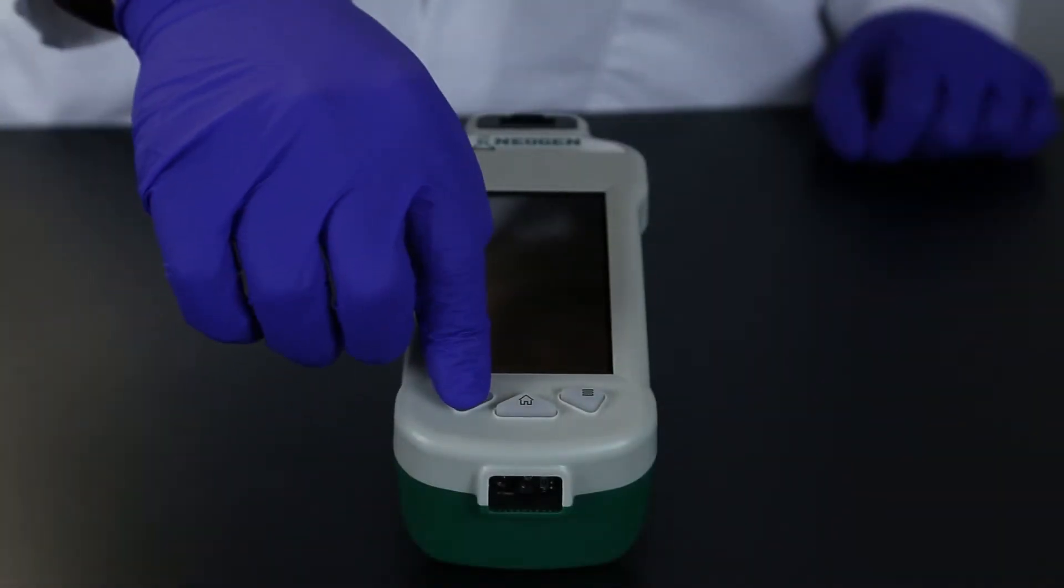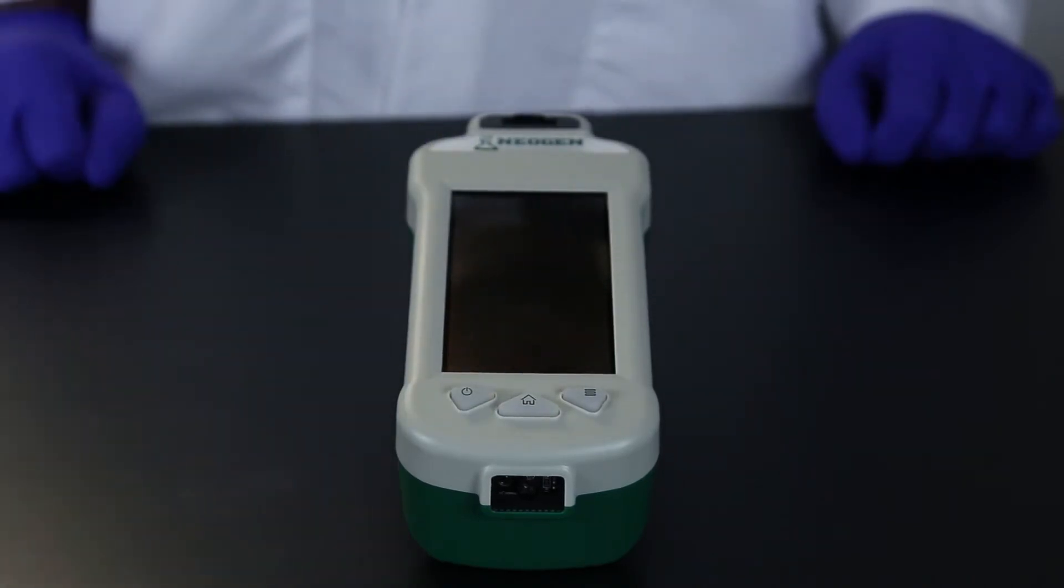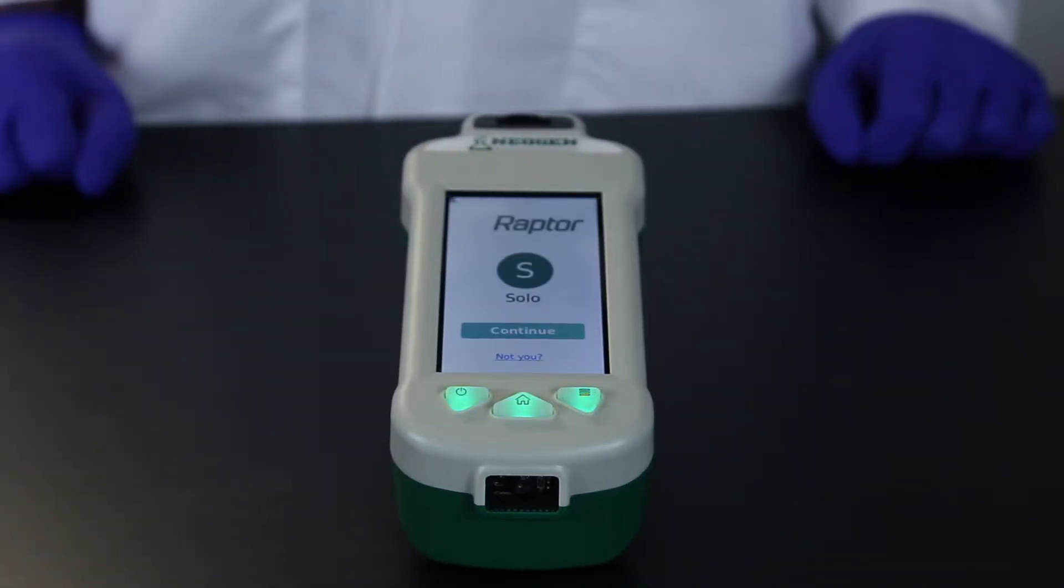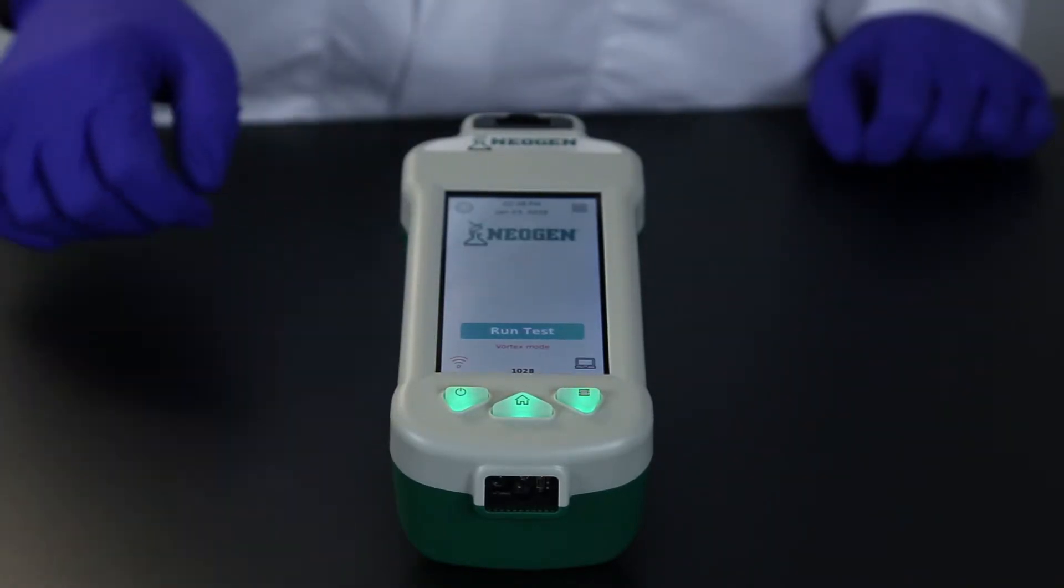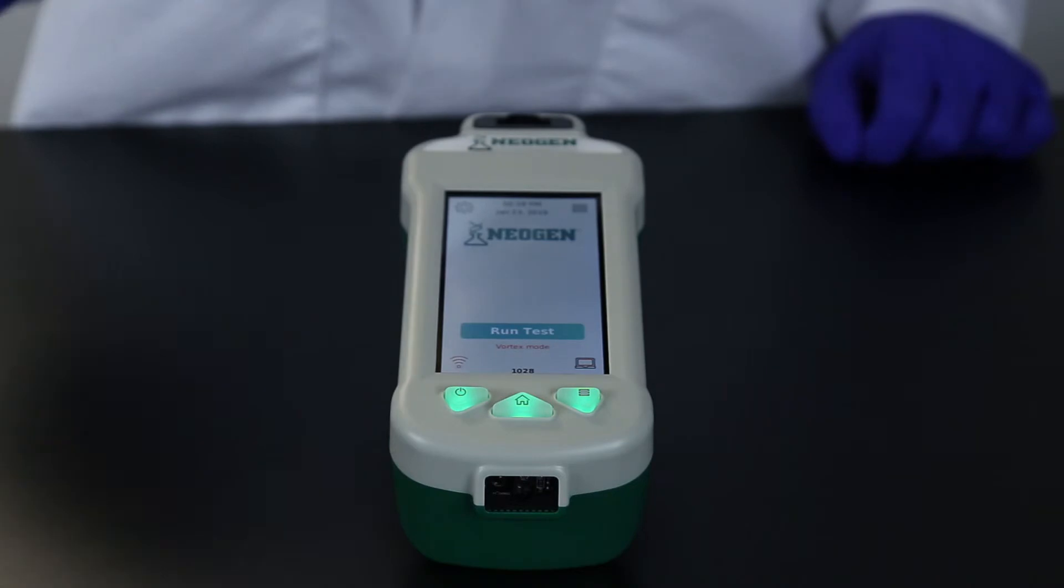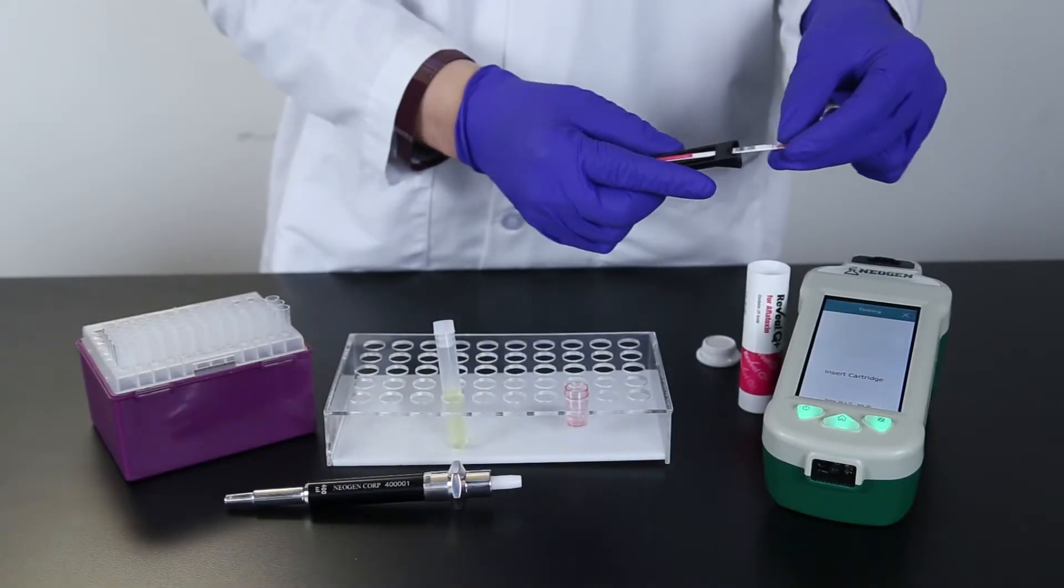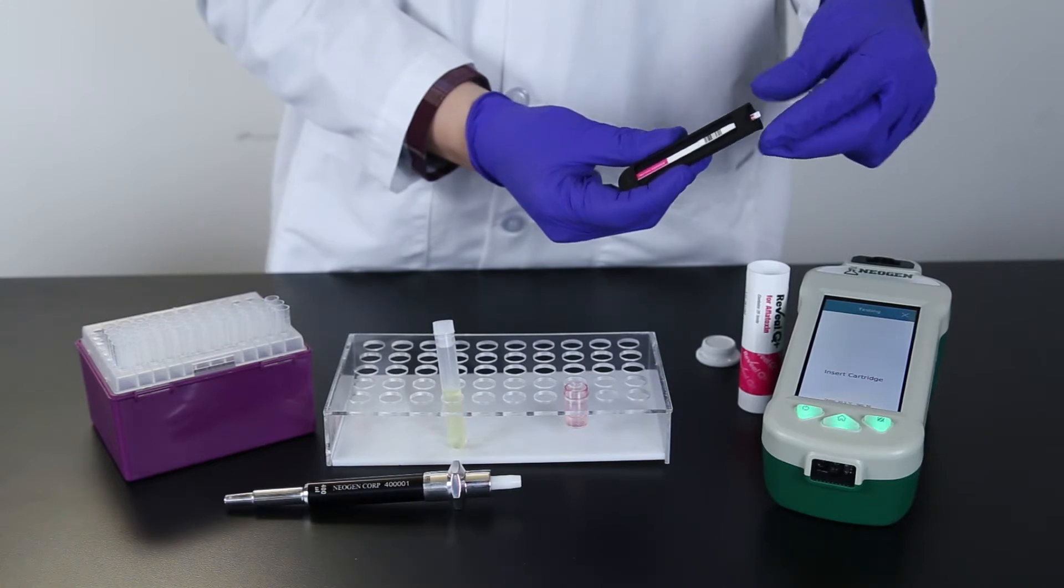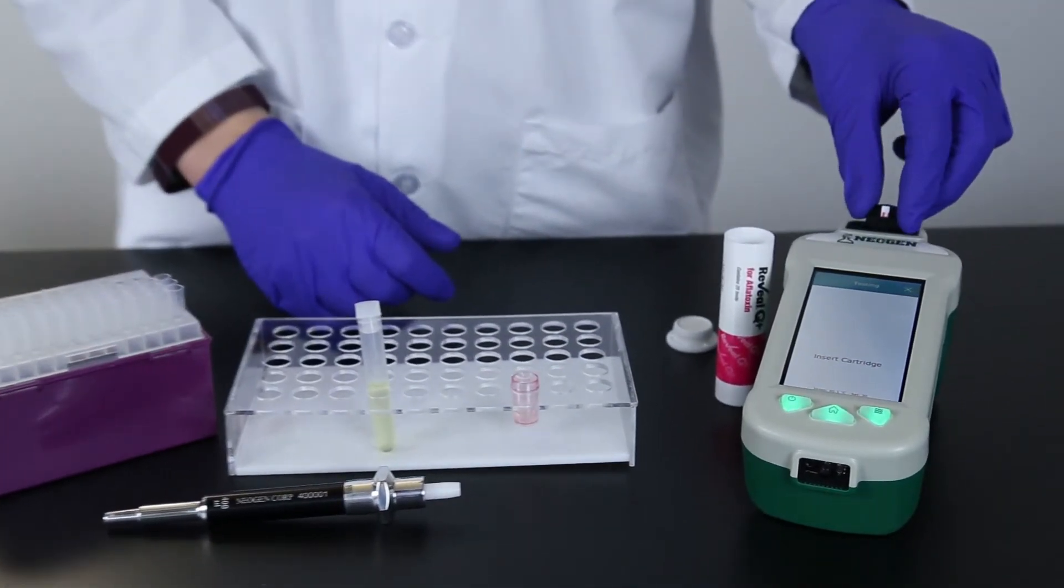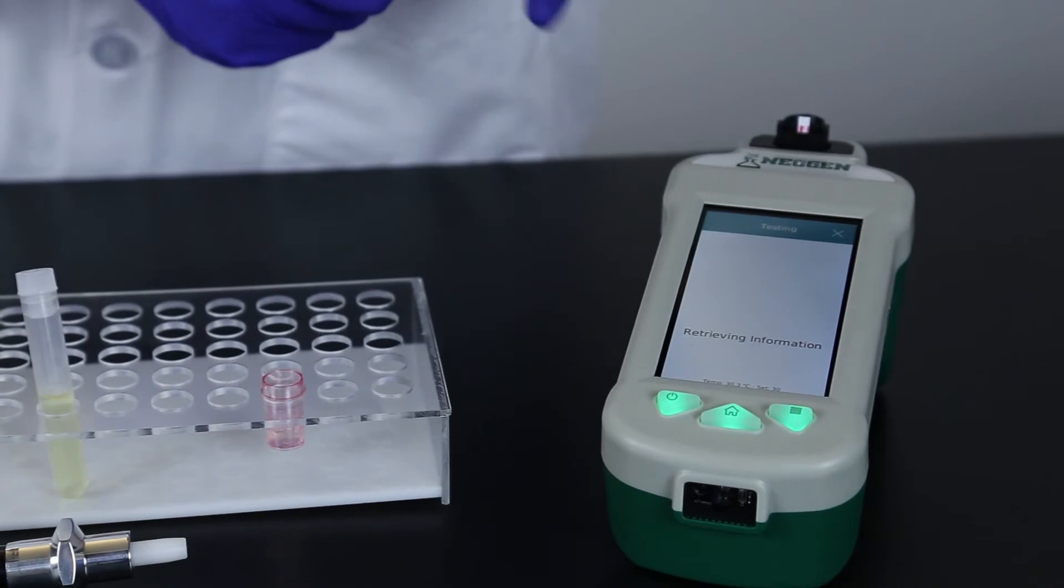Turn on the Raptor Solo by pressing the power button on the bottom left-hand corner. The system will initialize and display the home screen. Press the Run Test button. Place a test strip into the Raptor cartridge. Place the cartridge in the Raptor Solo system. The Raptor Solo system reads the barcode on the strip.